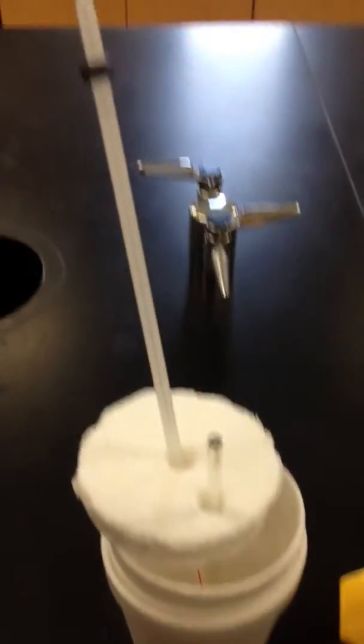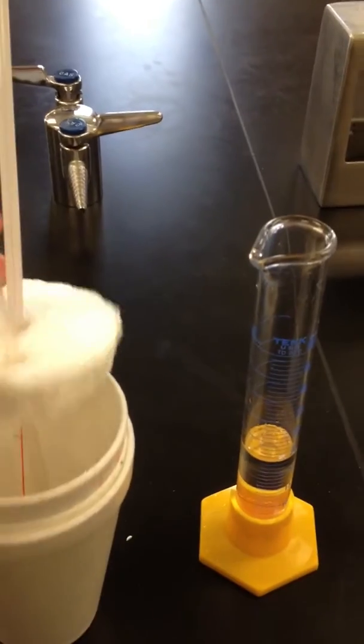You have a thermometer sticking through your calorimeter that you can read your temperature with, and you have a glass stir rod to assist in the stirring, should you need it.